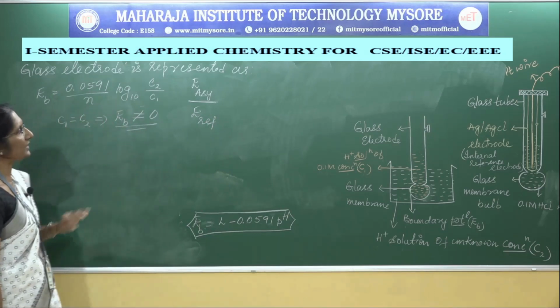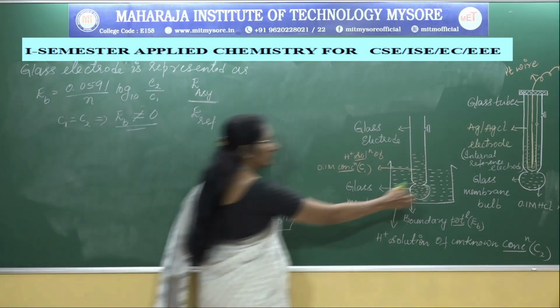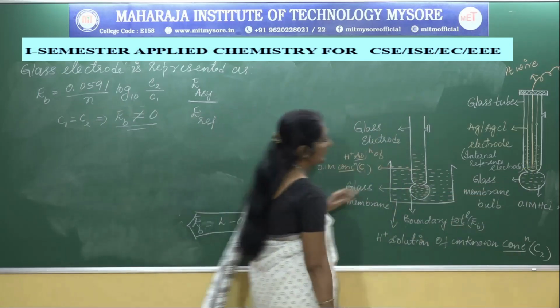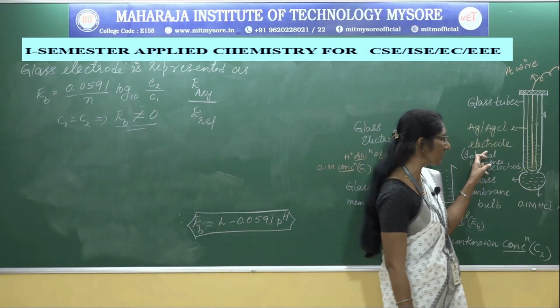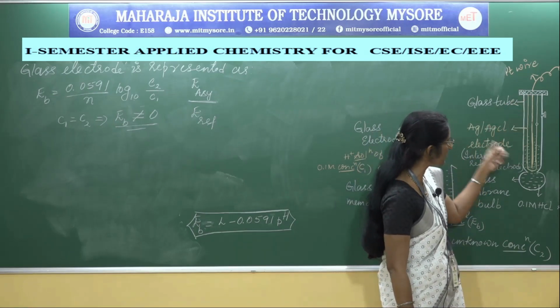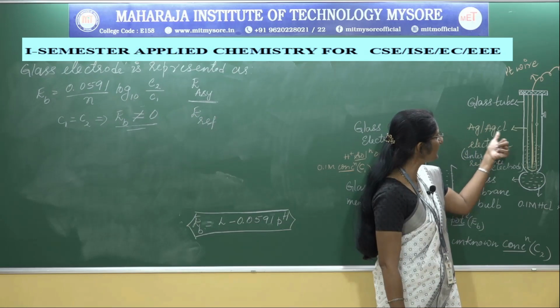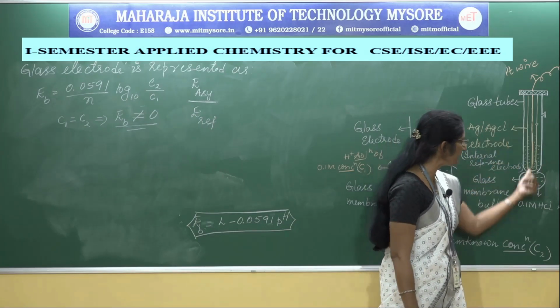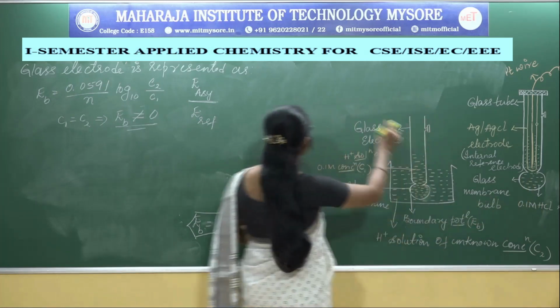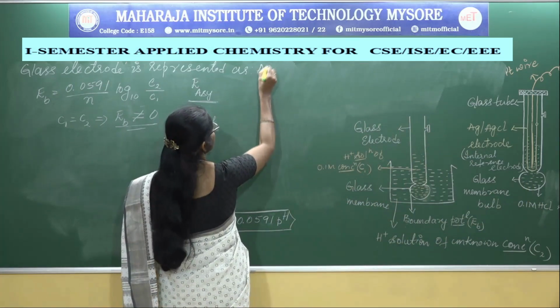So how is the glass electrode represented? First, we have to represent the internal reference electrode. Here the internal reference is a silver chloride electrode. It is constructed like this: a platinum wire is first coated with silver and then with silver chloride, then it is in contact with 0.1 molar HCl solution.